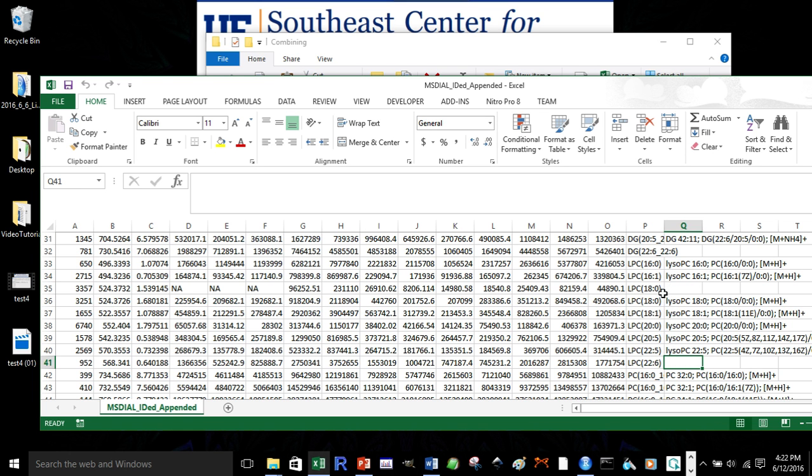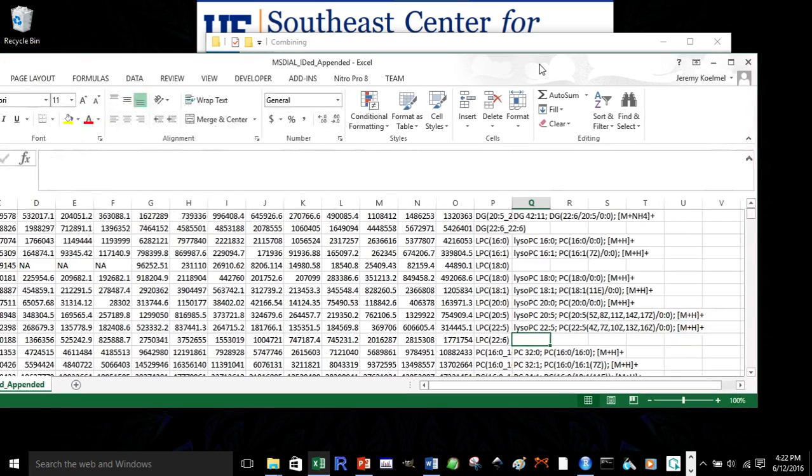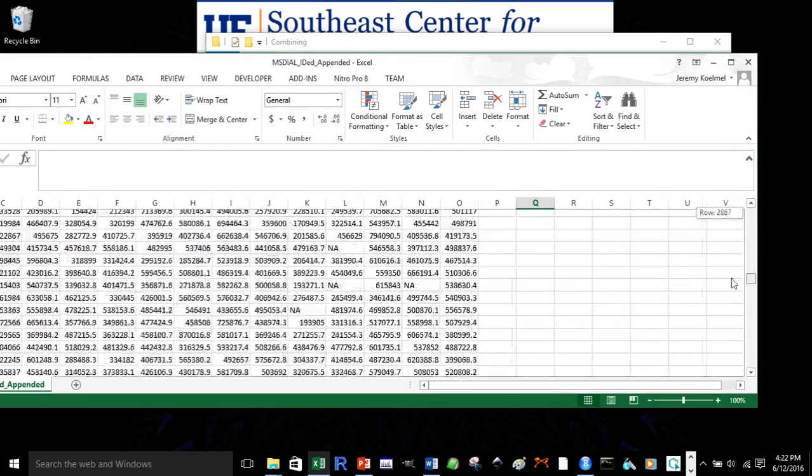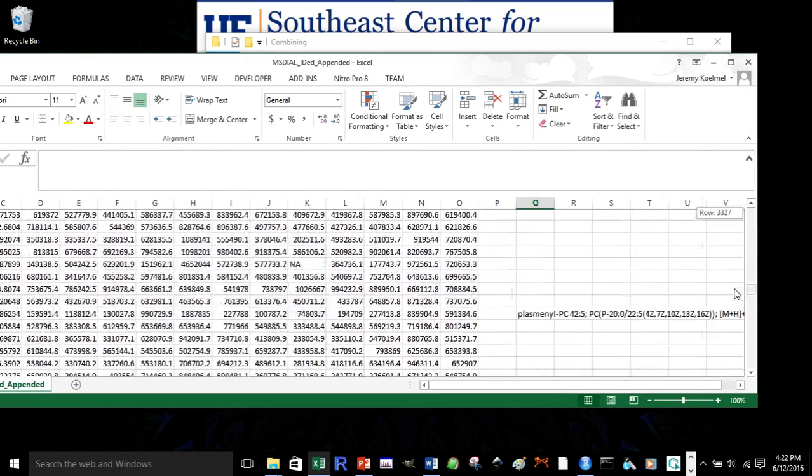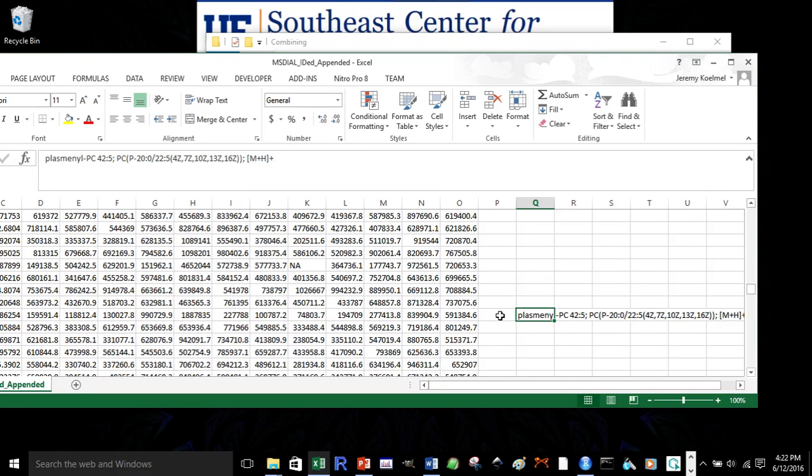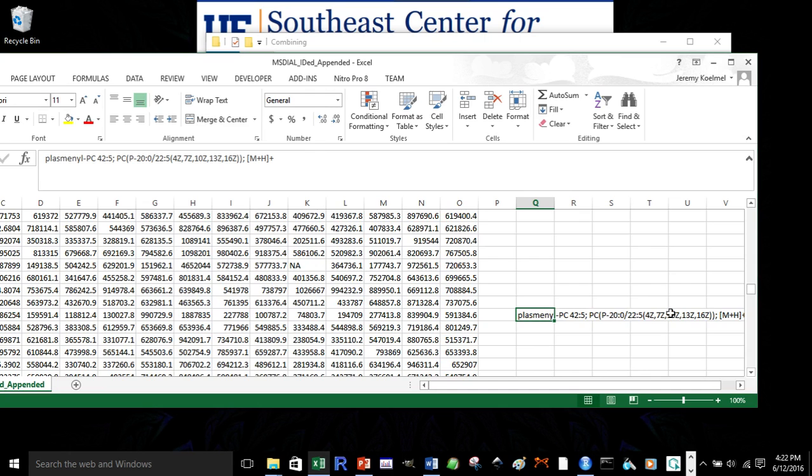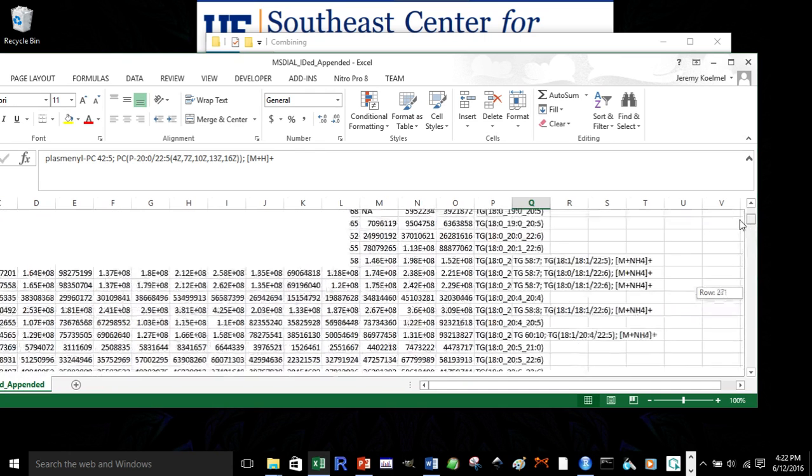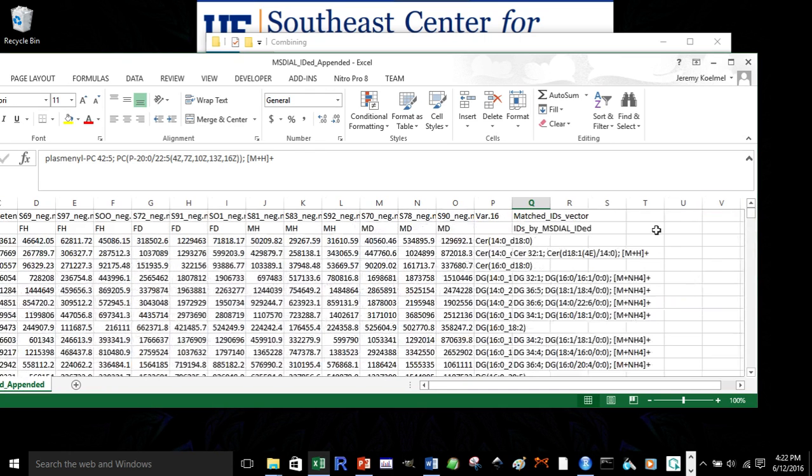In addition, if we scroll down, we can see that there's some identifications in MS dial for features that were not obtained in lipid match.